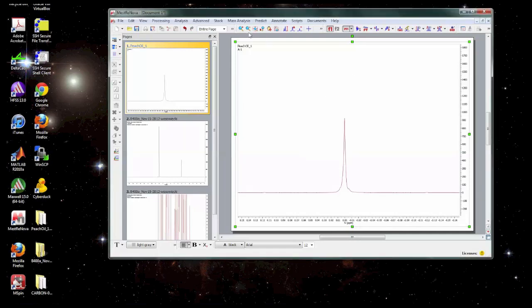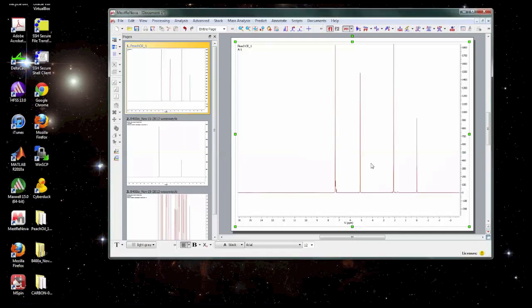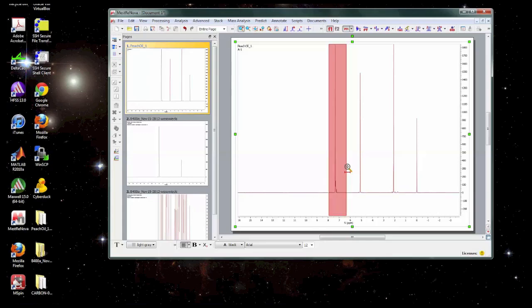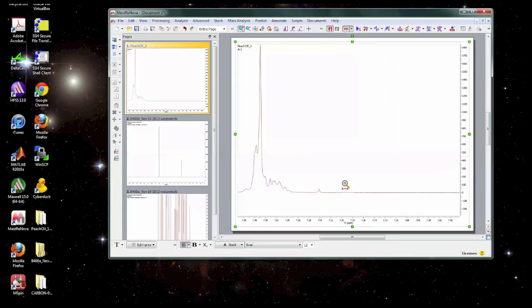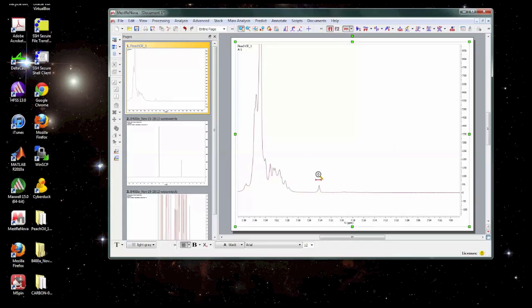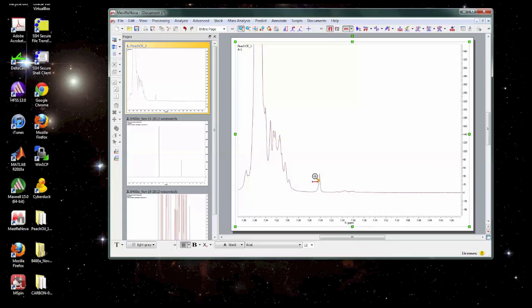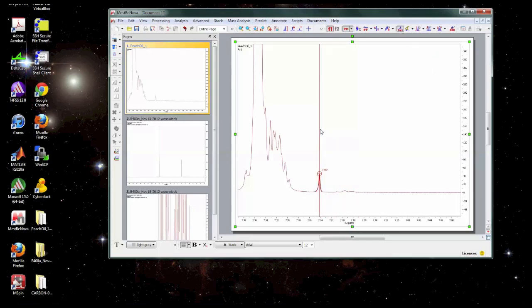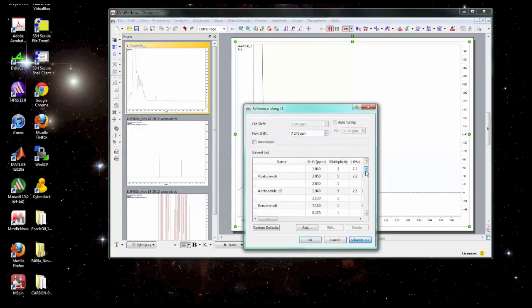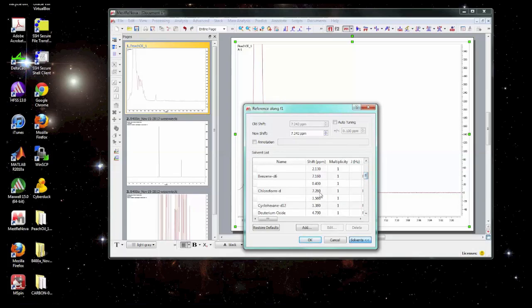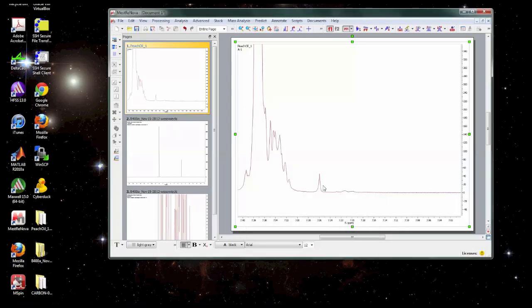Another way to do referencing is to use the solvent signal. So if there's a residual signal from your deuterated solvent, residual protons in your solvent, you could use this as well. So you could find this signal, select it, and then there's a table of a lot of common solvents here. So in this case it's chloroform. There's the residual proton shift of chloroform. You can select that and apply it. And now we're referenced using chloroform. You can see that these two didn't match exactly. That may be due to concentration effects.